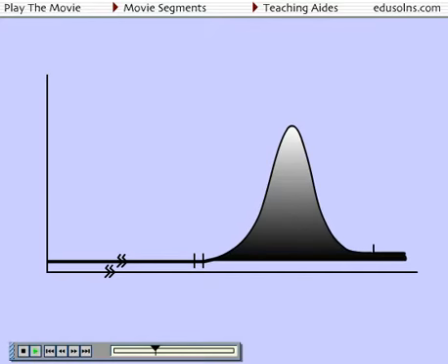One possibility is that the integrator will redraw the baseline between the tick marks and ignore the area between the projected baseline and the true zero. Another possibility is that the integrator will include the area below the first baseline of the peak. This can result in significant errors in the calculation of peak area and subsequently compound concentration if the baseline elevation is not consistent with the calibration standards and the sample peaks.